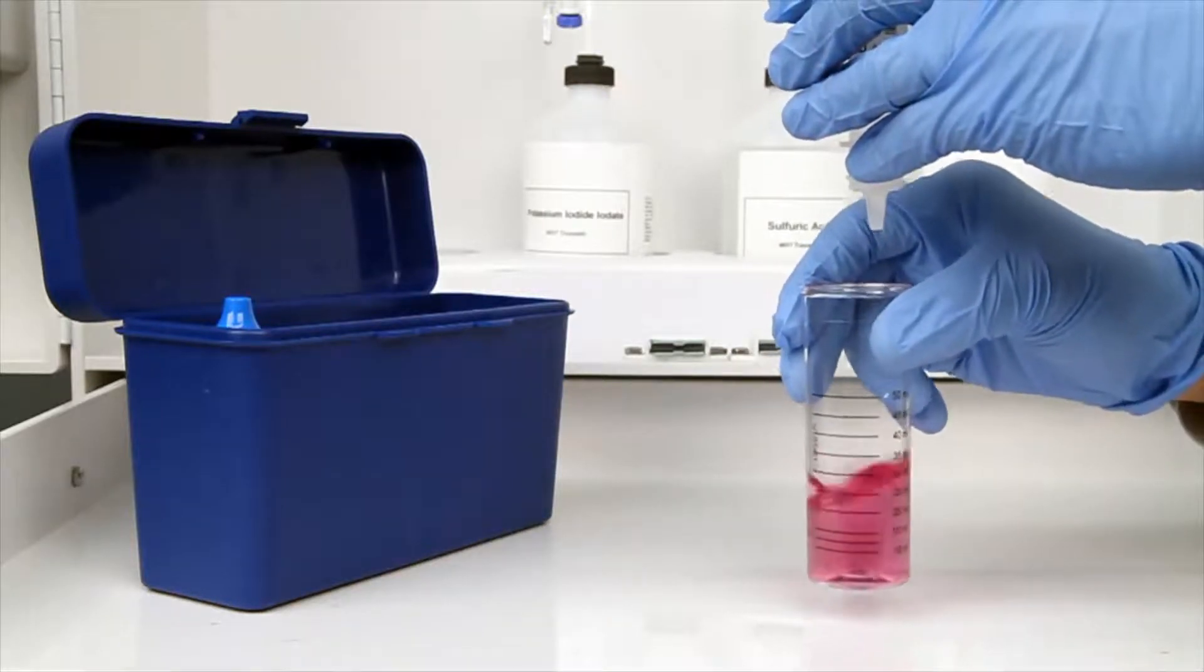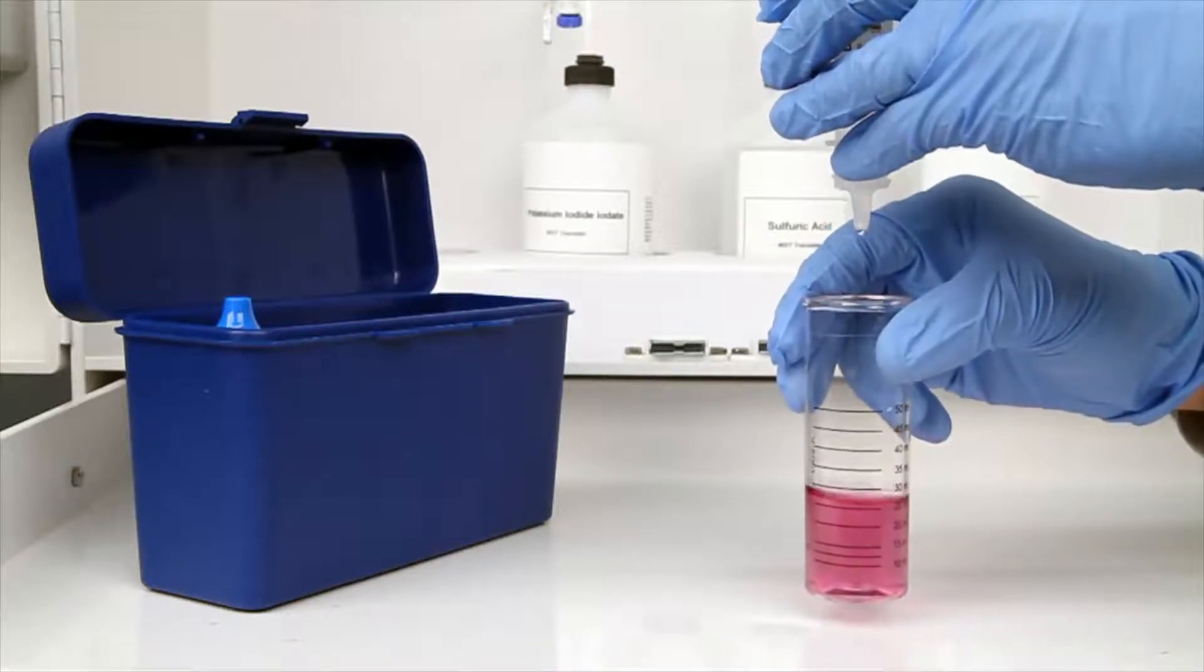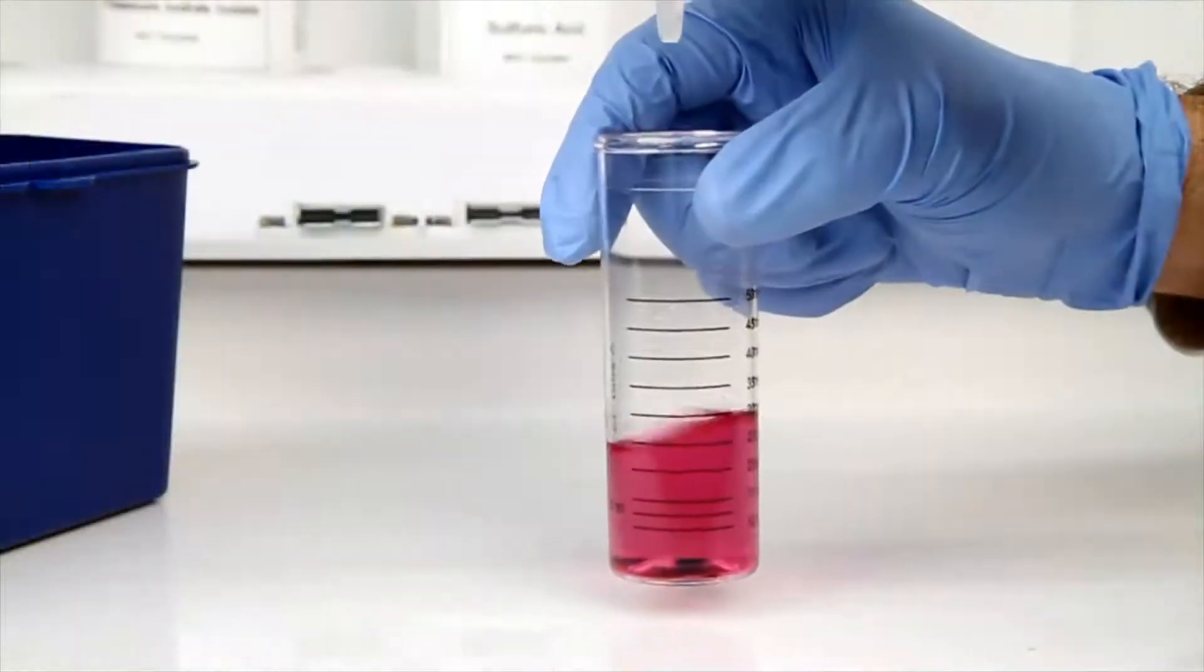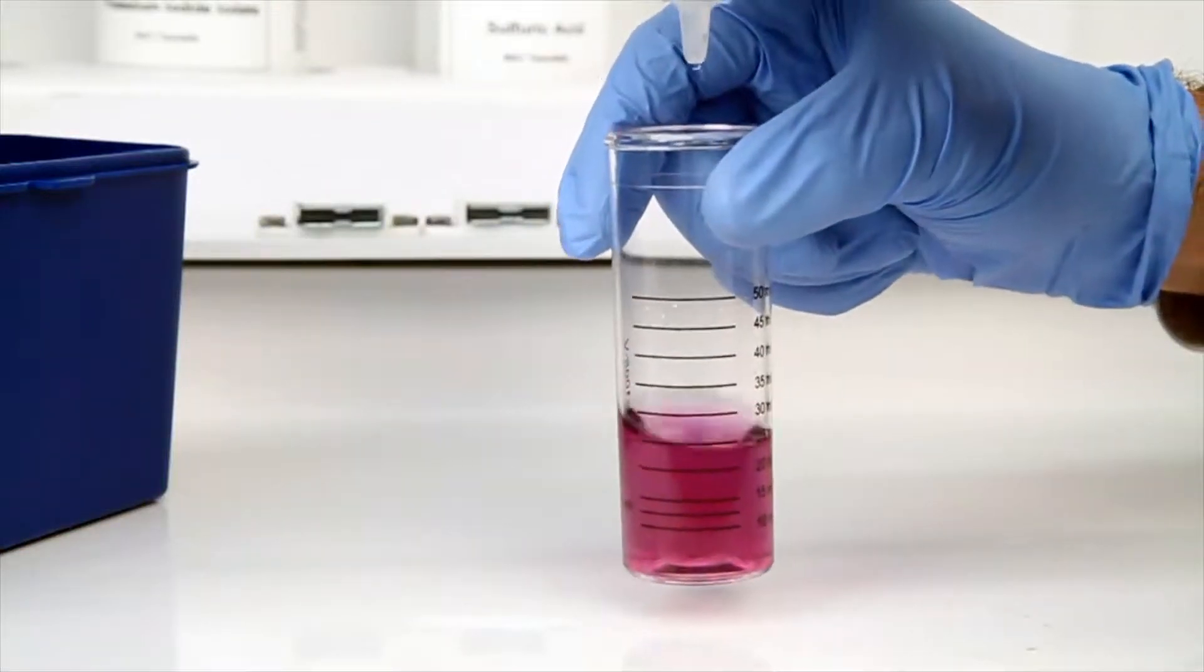The bottle of titrant contains a dropper tip, therefore it's important to hold the bottle vertically to make sure you get a consistent drop size. After the addition of each drop of titrant, you want to swirl the vial to make sure the sample is properly mixed.